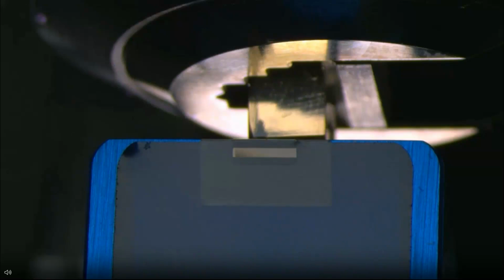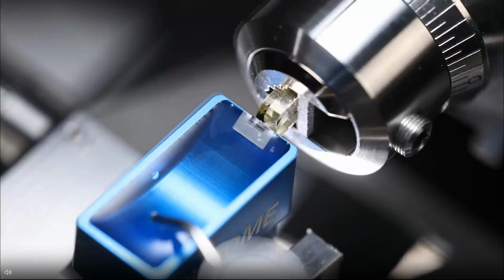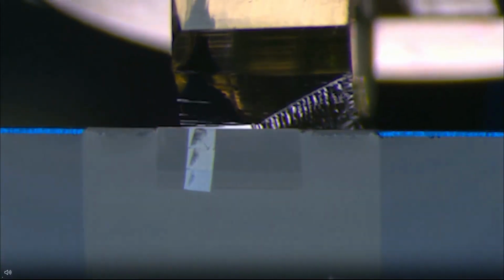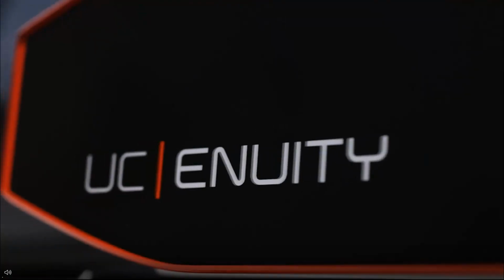Just set the eccentricity here and press Start. You see the full sections appearing. And then it's done.